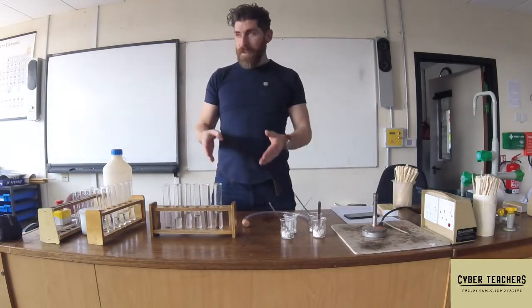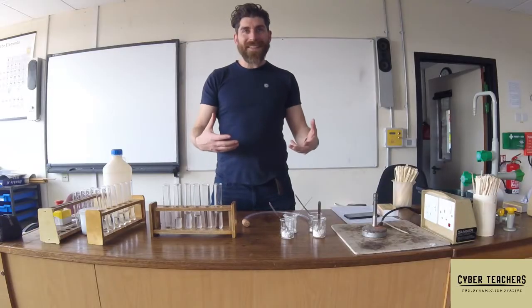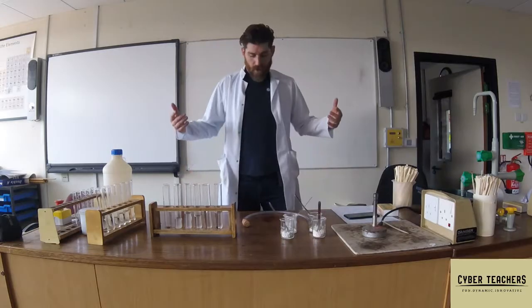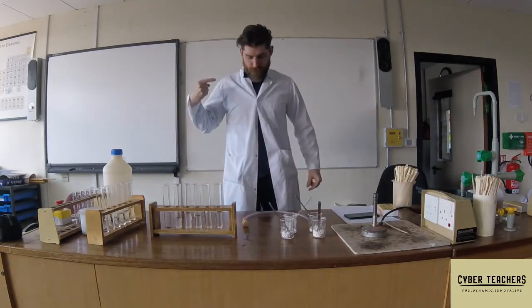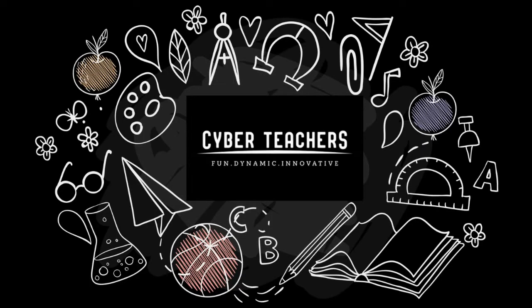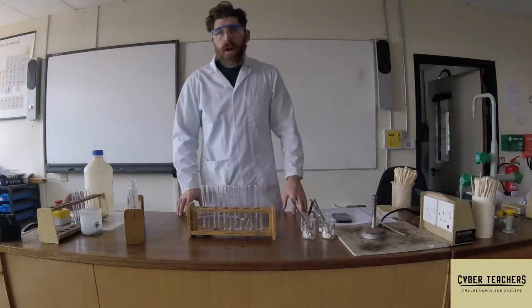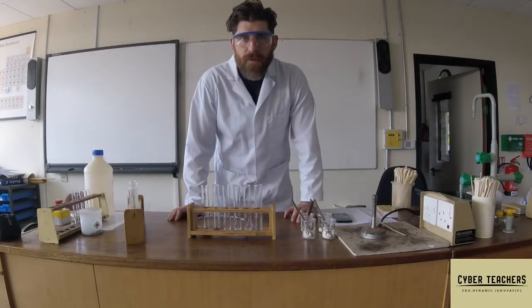Alright, let's look at some metal carbonates plus acids and see what gases they give off. But first we need our safety equipment - goggles. So we're going to react some metal carbonates with hydrochloric acid.